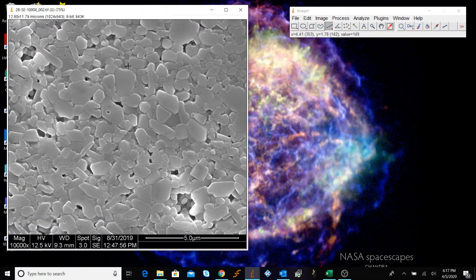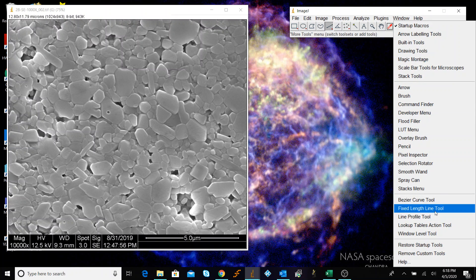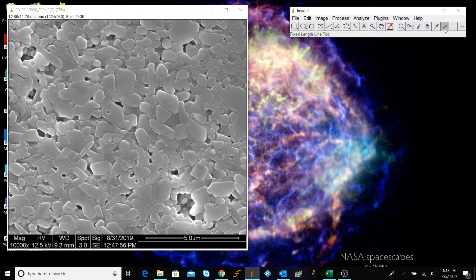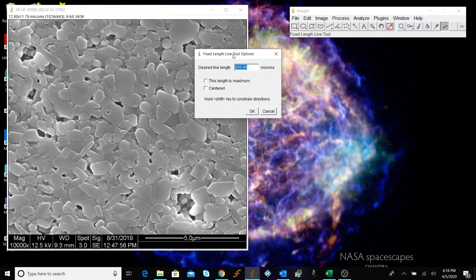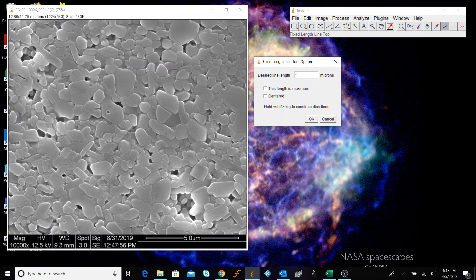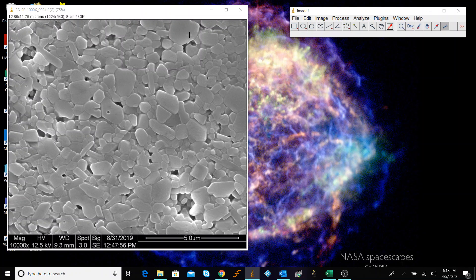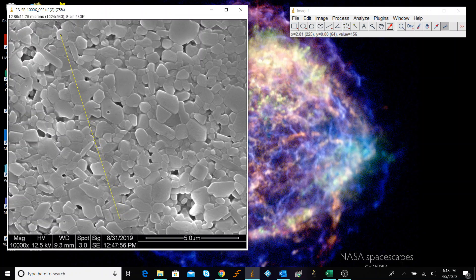Now we need to set a line of a certain length. To do that, we're going to use the Fixed Length Line tool. If it doesn't show up, click the double arrows and go down to Fixed Length Line. We know this scale bar is five microns, so if we right-click the tool, we can set a desired length — let's make this 10 microns. This will draw a line of exactly 10 microns based on the scale we set.